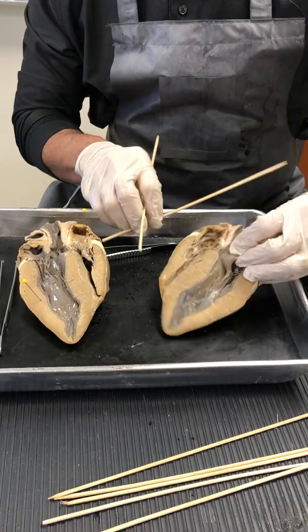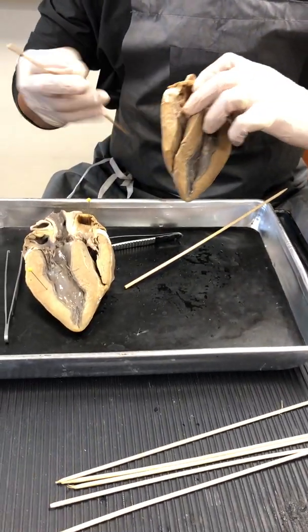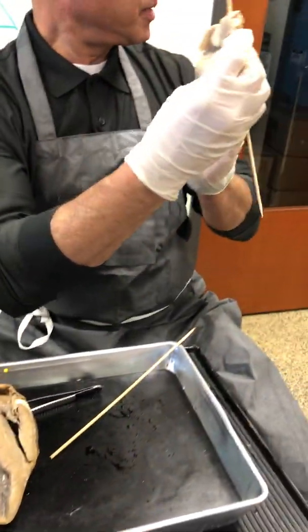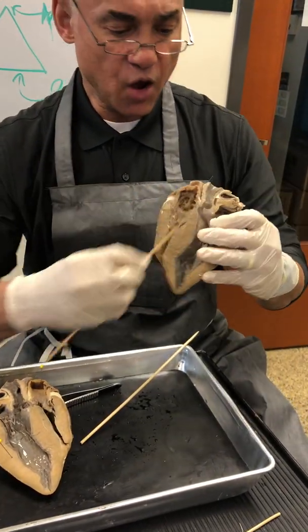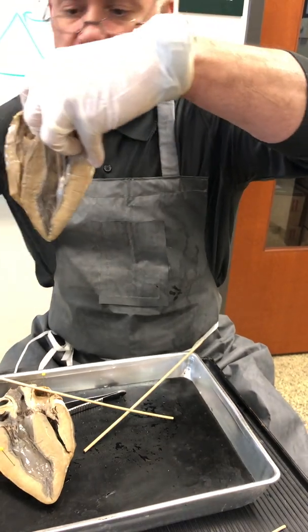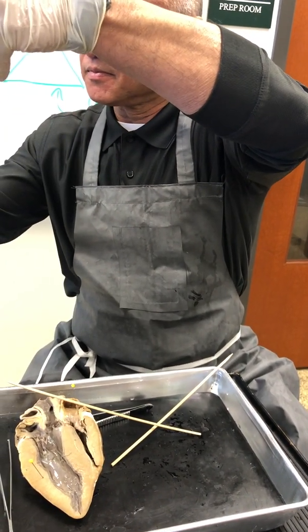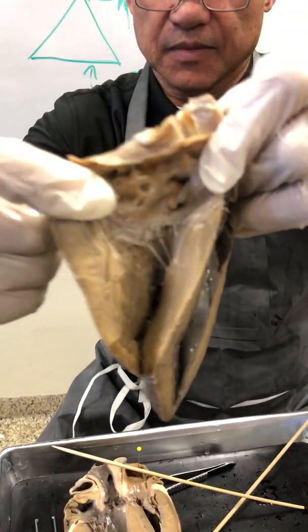So the second one that we're going to look for, oh yeah, now what you do, folks, is you open this up like that. So there's the superior vena cava right there. Okay, everybody good? It's just so you can see, superior vena cava. Now you open this up like that, and you look back into it, you're going to see 2 holes. Like there.